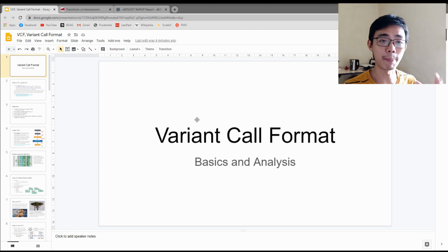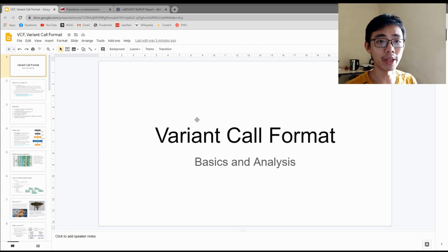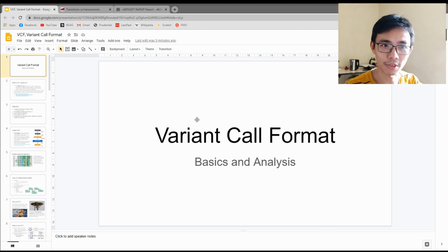The second part will be about the actual data itself and how you open a variant call format file and understand the meaning of every single component within the file format. So that maybe will be 2 videos. And lastly, it will be followed up by several examples, to understand based on the examples if your understanding is correct on the previous videos. Finally, we'll finish up with a little bit of exercise and knowledge-checking questions to see if you can answer those questions. If you can, congratulations.